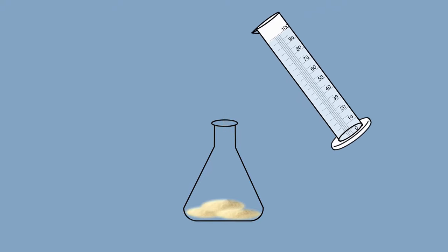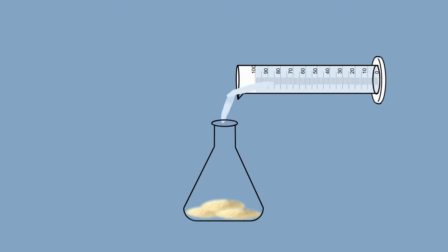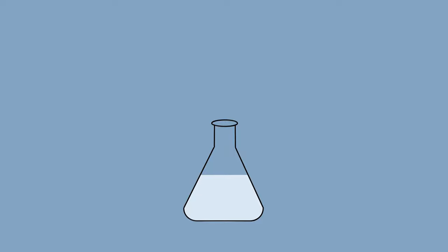Now we are going to add 100 ml of distilled water into this flask. After addition of the water, shake well and mix the ingredients properly using a glass rod. If clumps of powder are formed, then you can slightly heat the flask containing the media. Once the powder is dissolved properly, plug the mouth of the conical flask using non-absorbent cotton. This is called plugging the flask.